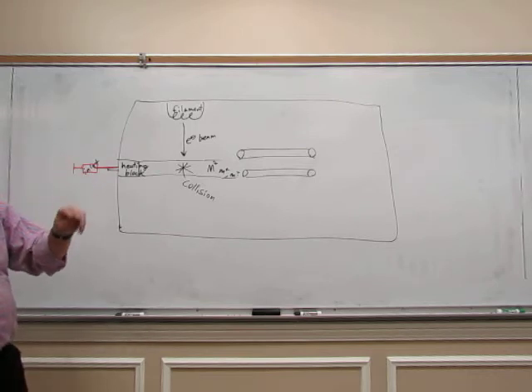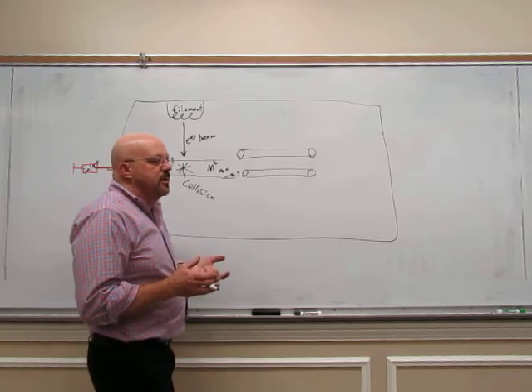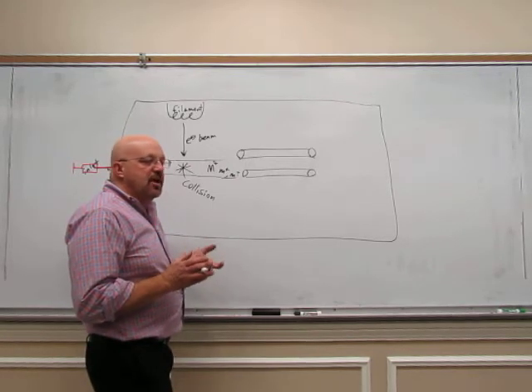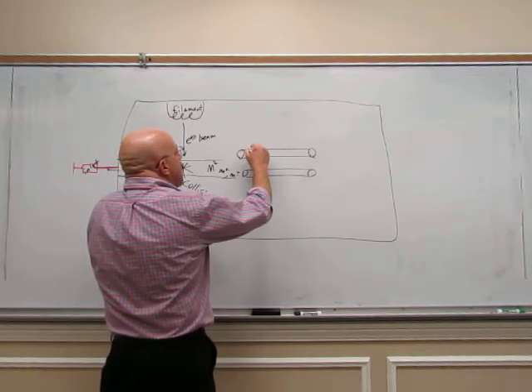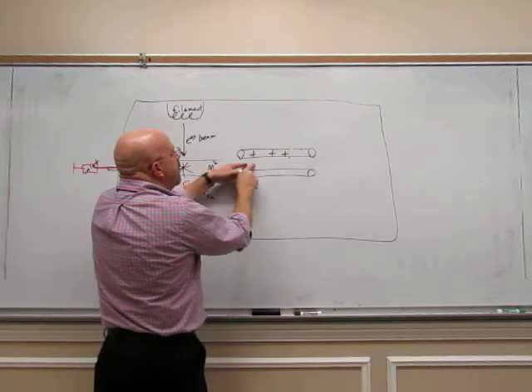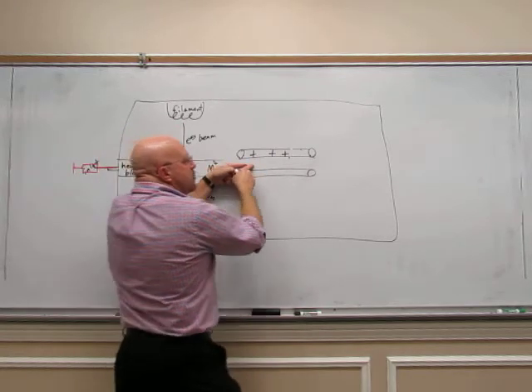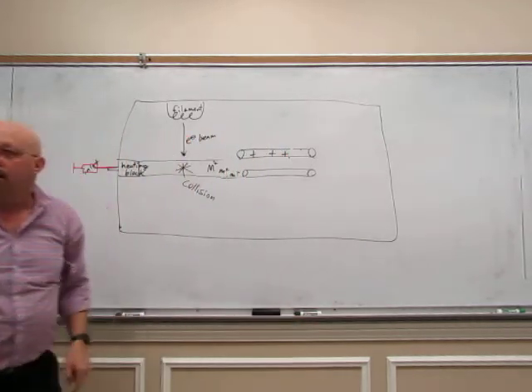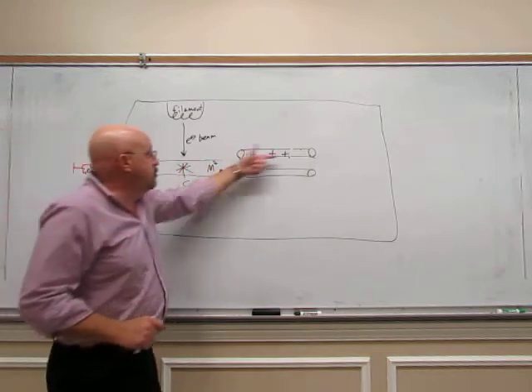And there's 4 poles, and these poles we can run voltage across and change the charges of those poles. You can imagine if these poles were positively charged and our molecules come in here, then they will repel each other, and so it shoots those through really quick because they're repelling each other. And so it just happens in just microseconds. It shoots those through there.